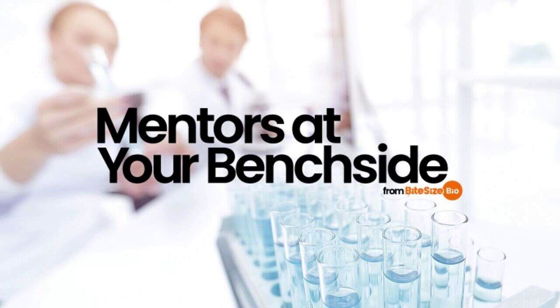The protocols normally emphasize the importance of being gentle to prevent shearing of the genomic DNA, but I find that people tend to be too gentle. Another common problem is that the lysis is allowed to proceed for too long, resulting in permanently denatured, undigestible DNA. Here are some tips for improving the lysis and neutralization steps and increasing your plasmid yield.